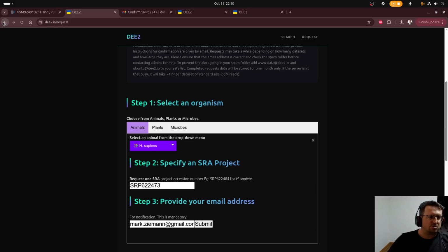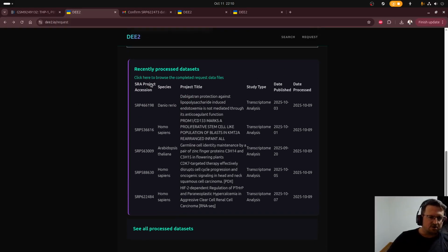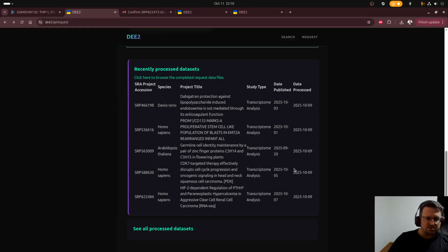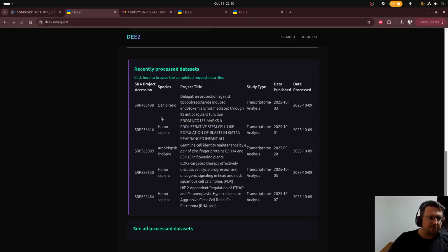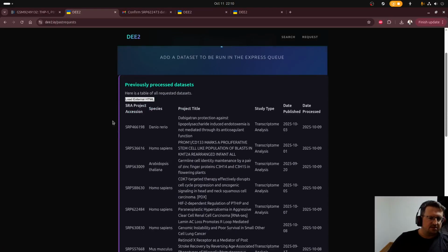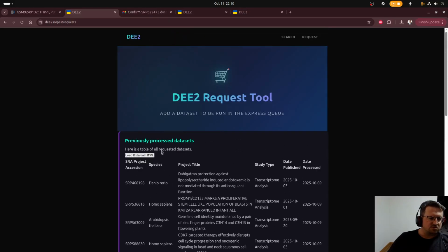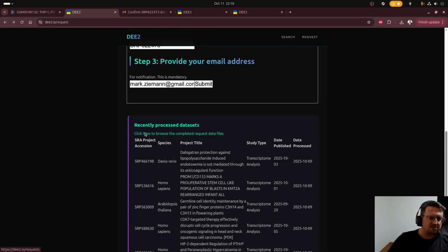What I'll show you as well is here at the bottom we've got some of the recent studies that have been analyzed and requested, so you can see what the DEE2 community is requesting. This is just the latest 5, but if you wanted to see all of the past ones, you can click down here and load this table so you can have a look. Maybe there's something of interest to you. You'll go back, and if you want to download those data sets, they are available.